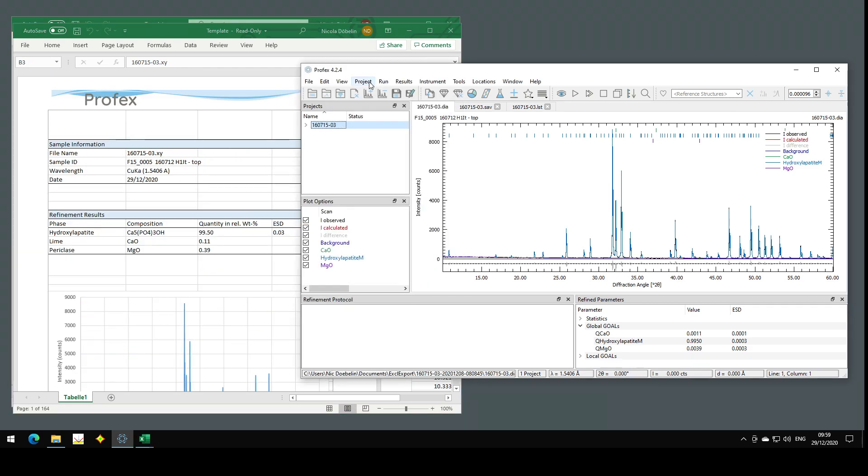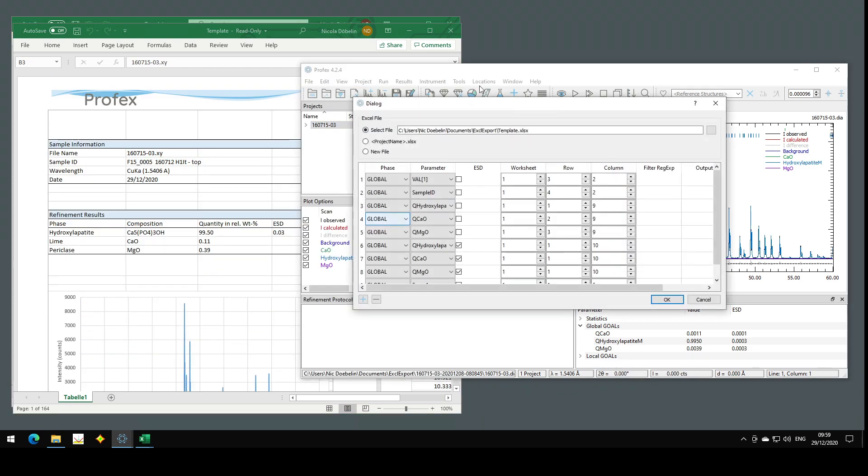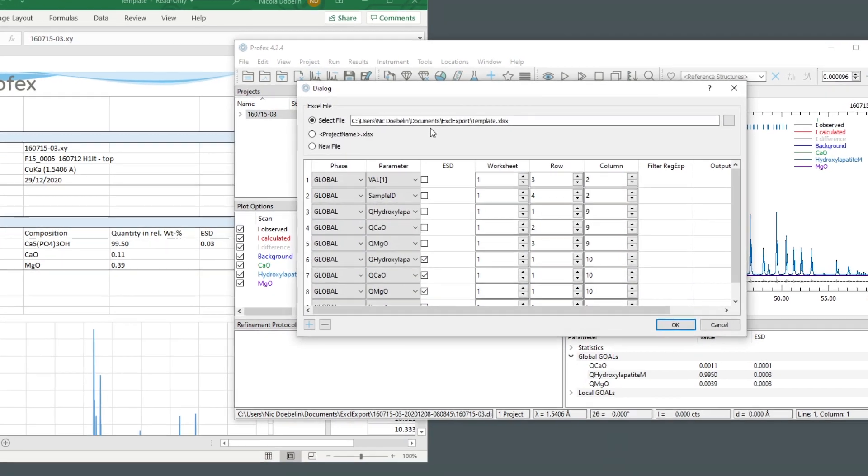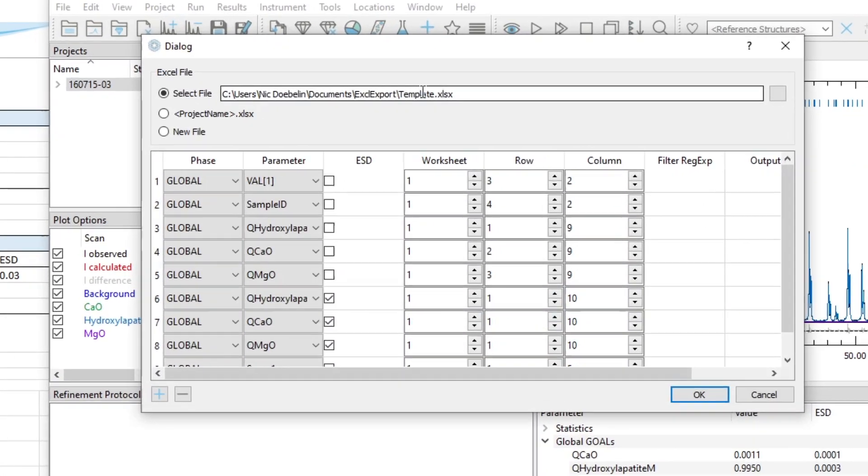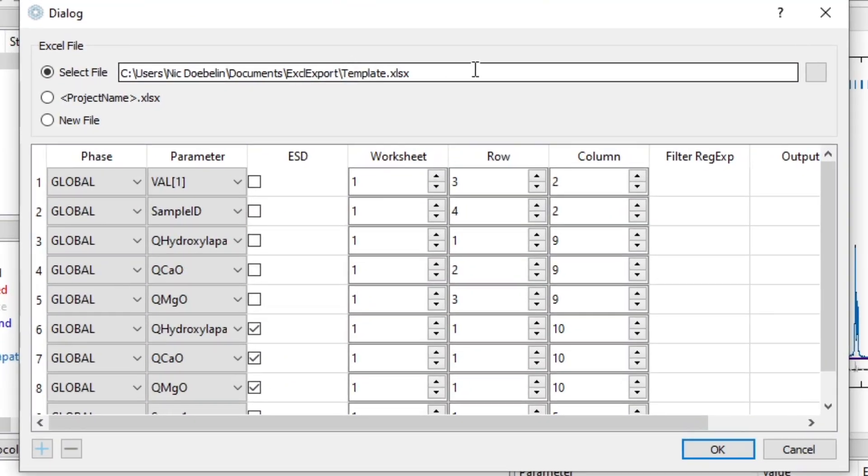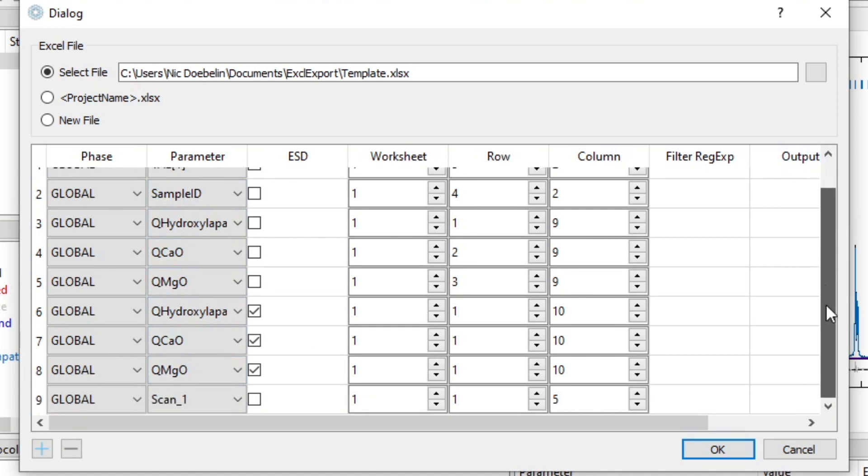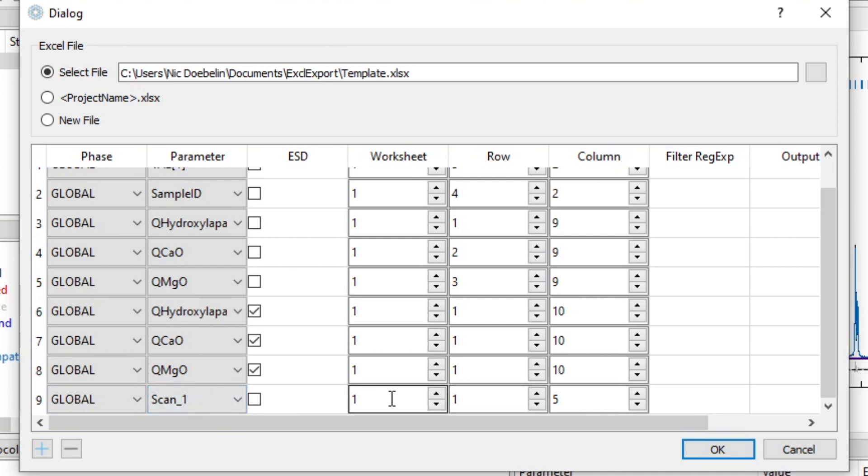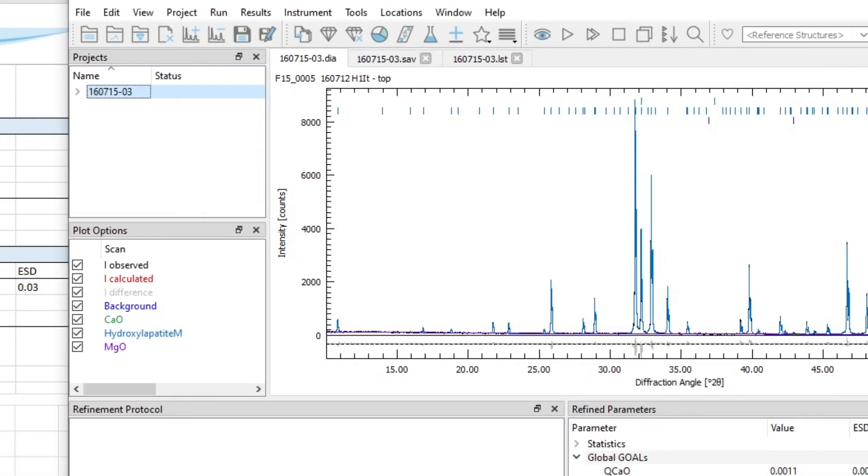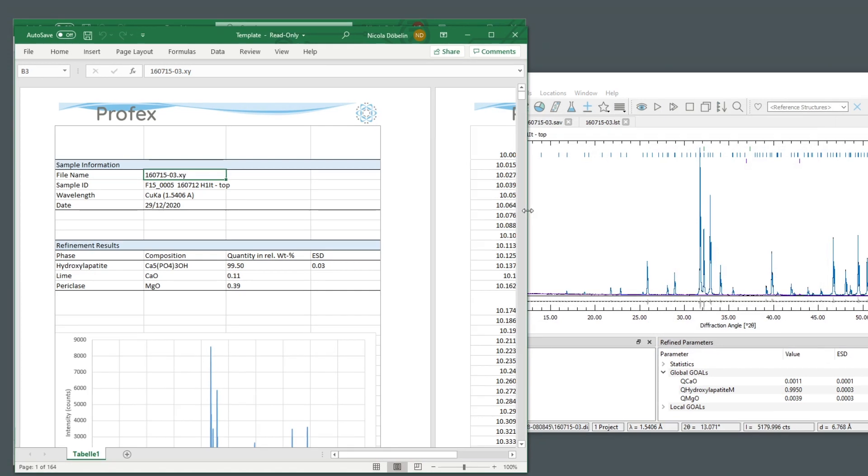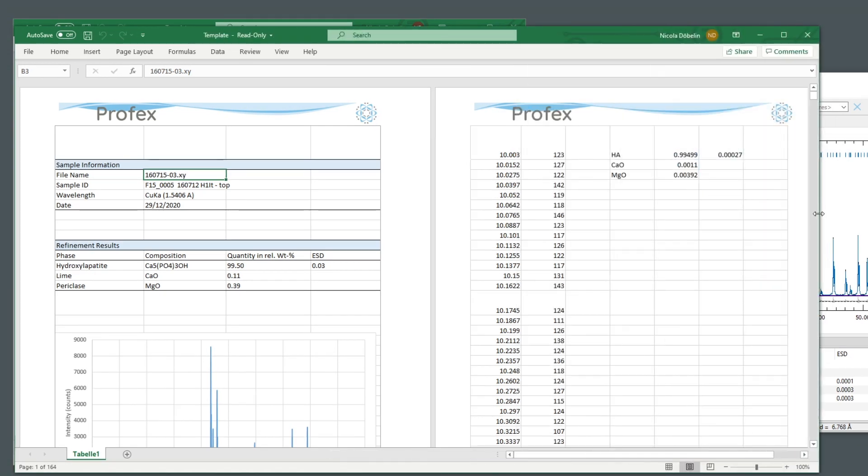I specify the template file name on my hard disk. I am writing the raw data file name to this cell, the sample ID, the quantities for the three phases, the ESDs for the three phases. And then I also export my scan number one to worksheet one, row number one, column number five. And this is what we can see here on the second page.